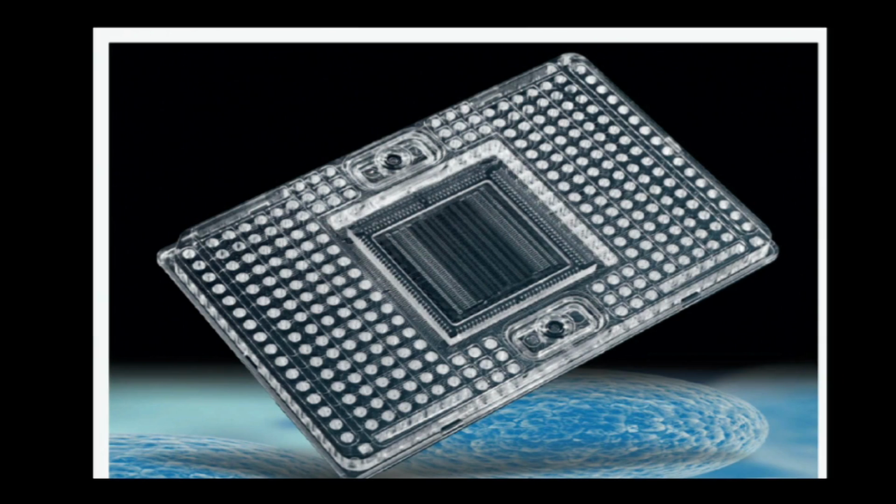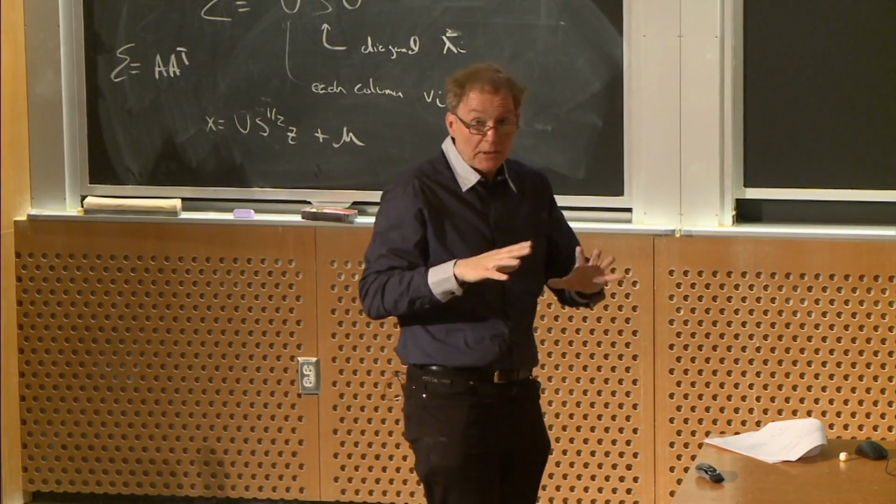This is a Fluidigm C1 chip, which has 96 different reaction wells, which allows you in each well to process a single cell independently. And the little lines are ways to get reagents into those cells to do things like produce RNA-seq ready materials. And when you do single cell analysis, you can take apart what's happening in a population.